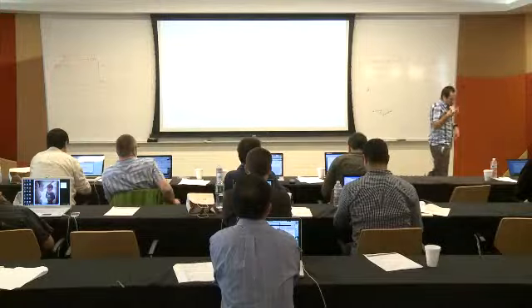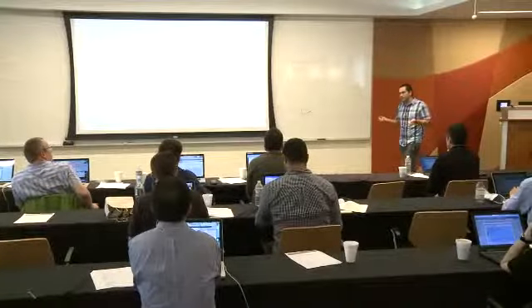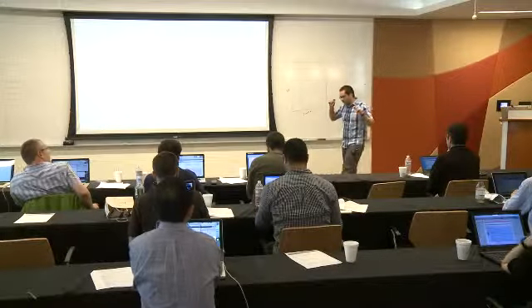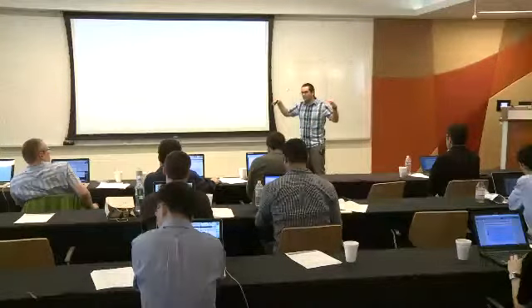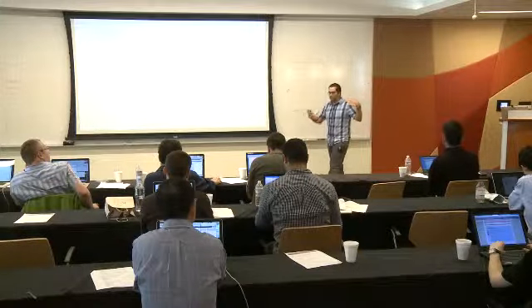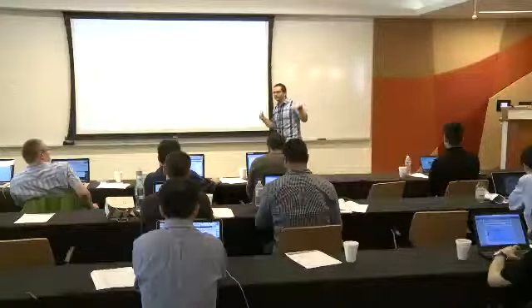In the GenePattern module that we've generated, we take each sample and we normalize it to the ratio for 20 million reads. So if we had only 10 million reads, we know that we have half of the reads that we would expect.